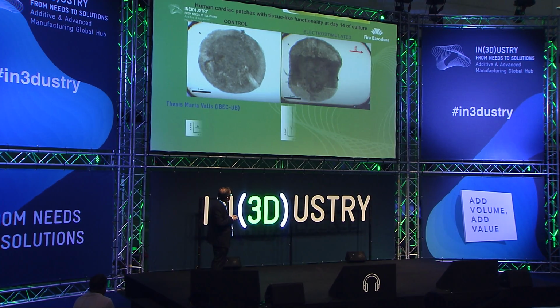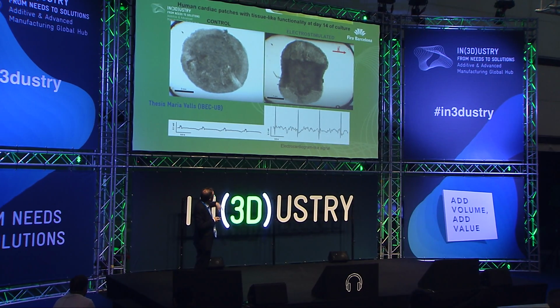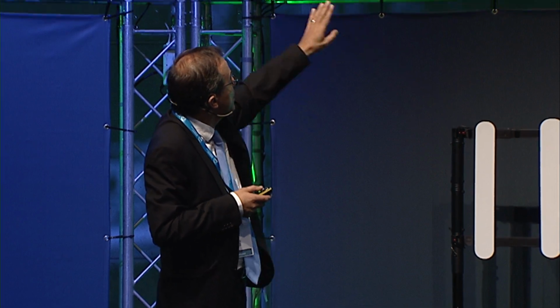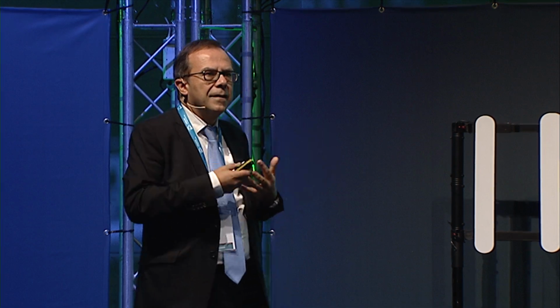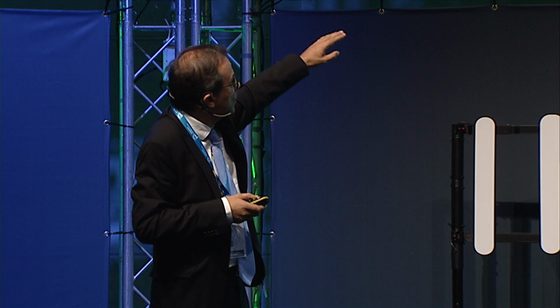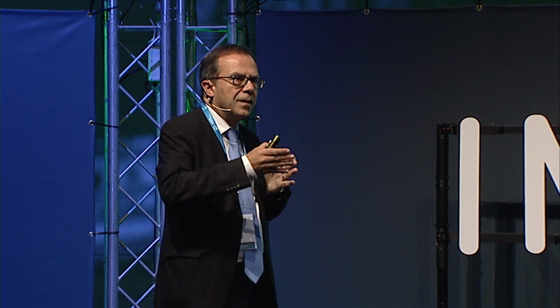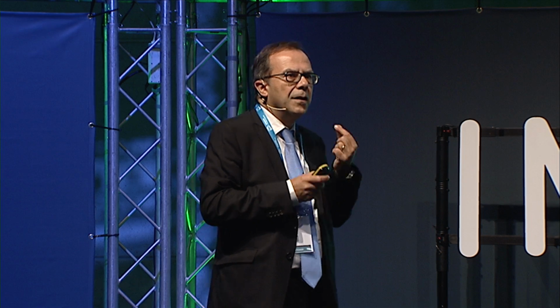But the more relevant is that if you analyze the electrocardiogram obtained from the 3D patch, this electrocardiogram is very similar to the cardiac electrocardiogram of the organ, with the difference from the control, where the cells are not well stimulated, they are not well interacting between them, and in this case, the stimulus is very bad. So, using the right way of 3D printing together with the bioreactor together with the cells, it is possible to mimic and to produce in vitro a patch that has the same response as a 3D cardiac tissue.